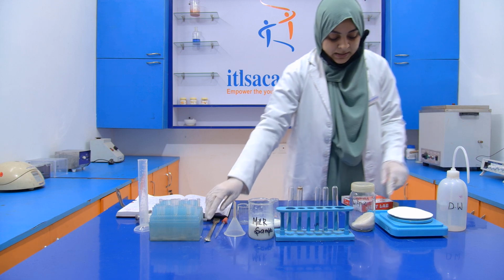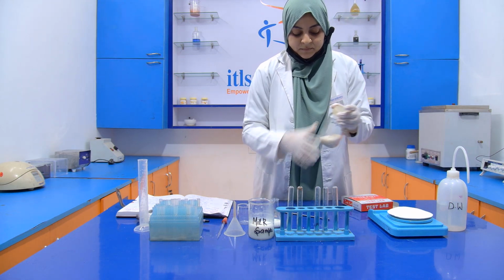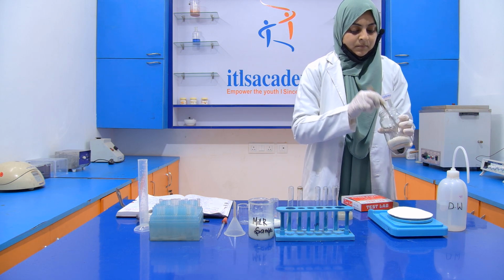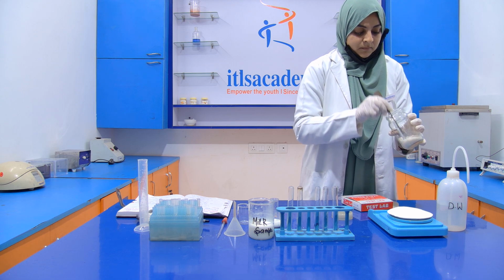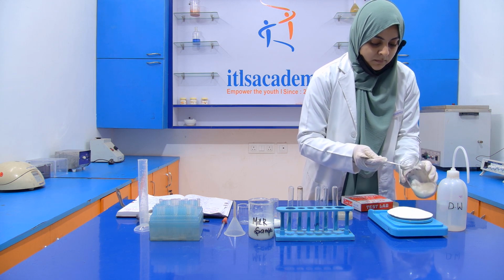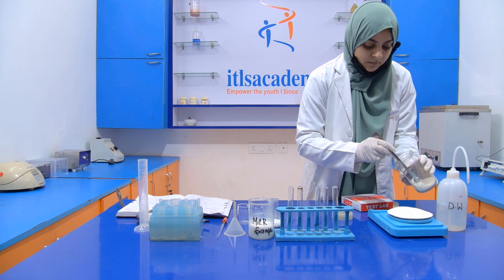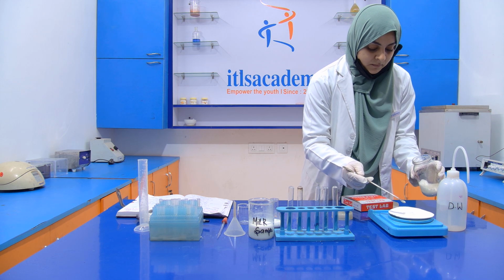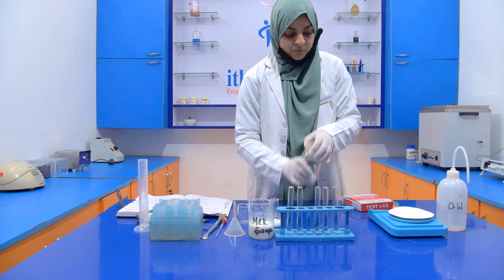Don't forget to tare the weight. This is 4 grams.